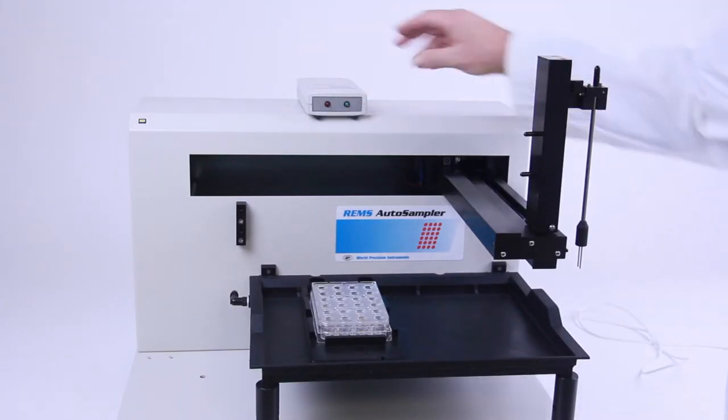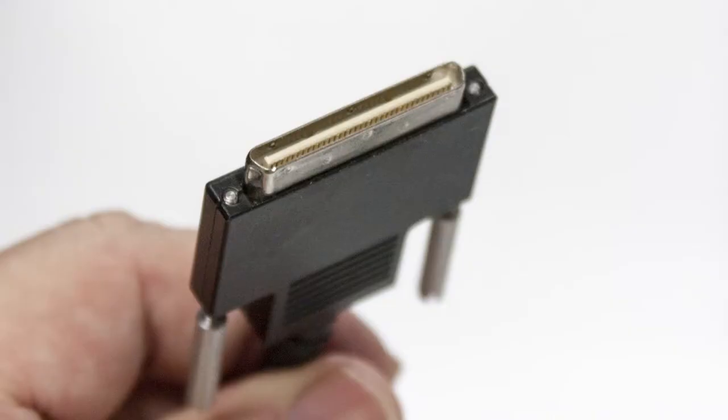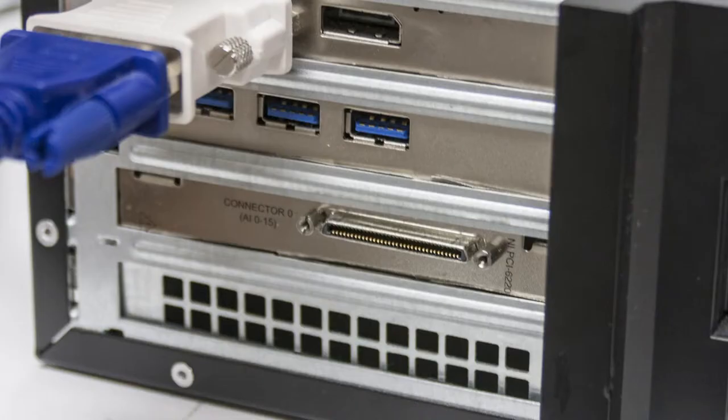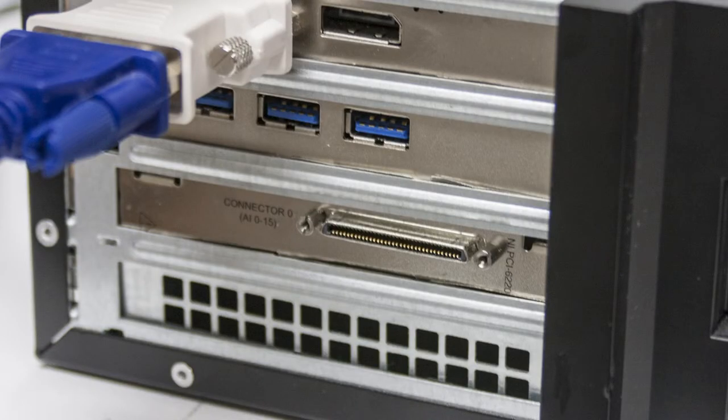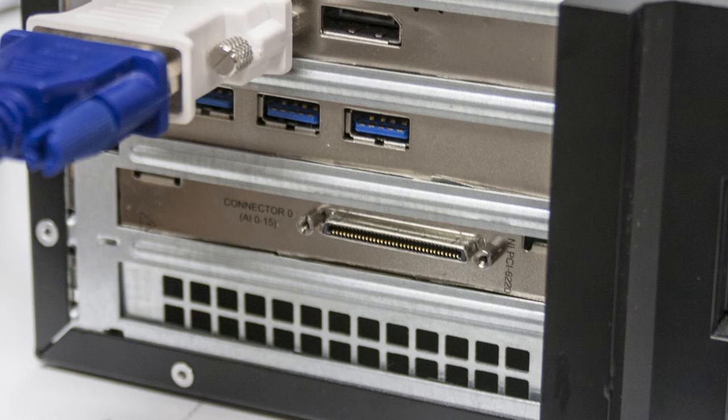The REMS interface unit will be used later when the real electrode is installed. To record the data from the electrode, the electrode cable plugs into one end of the REMS interface unit. The 50-pin connector on the cable included with the interface unit plugs into the port on the data acquisition board, which is installed in the computer. Be sure the computer is powered off before making this connection.